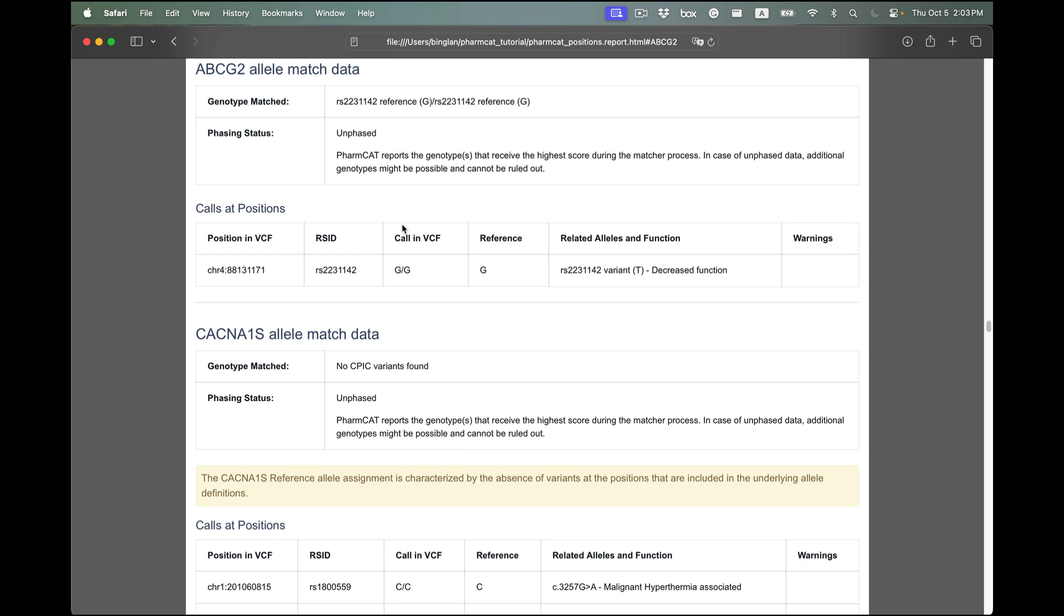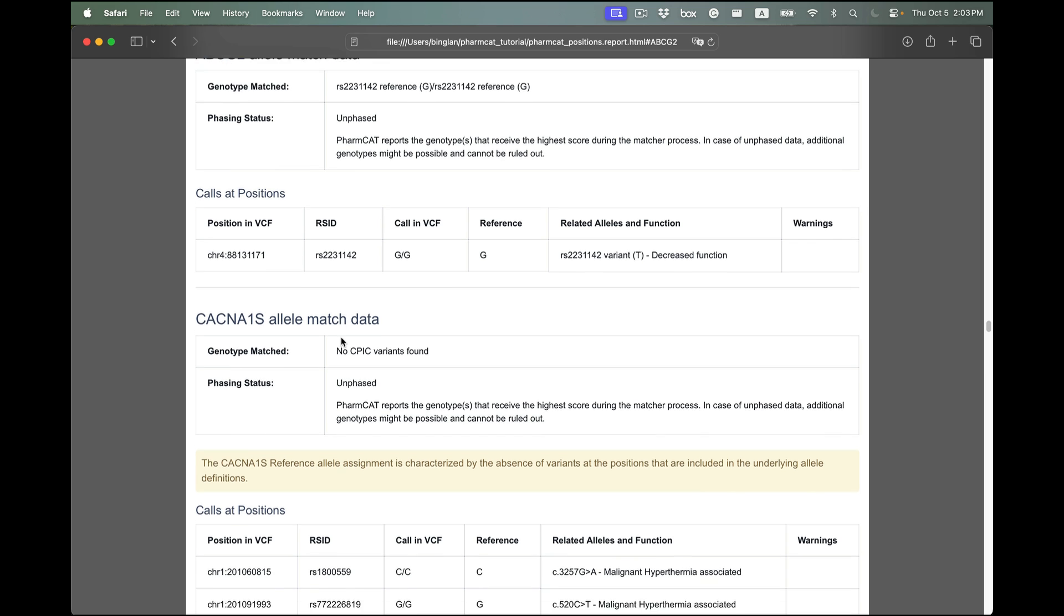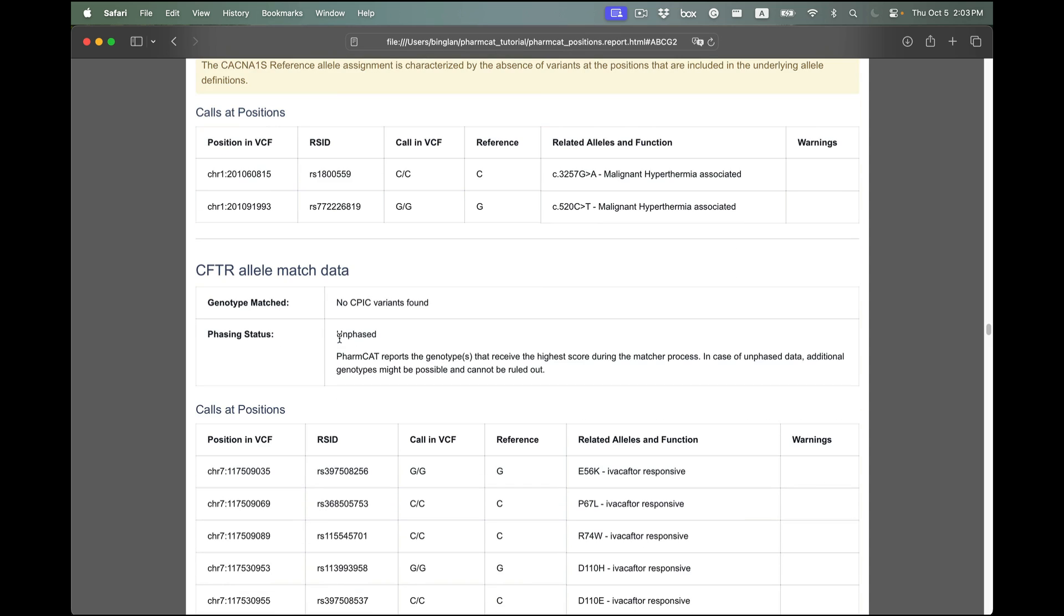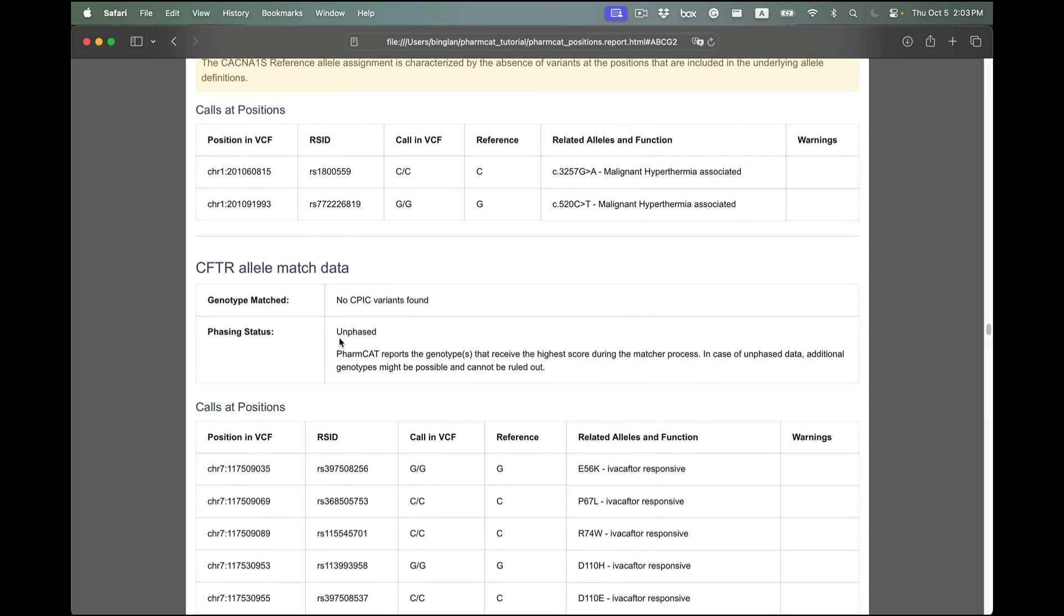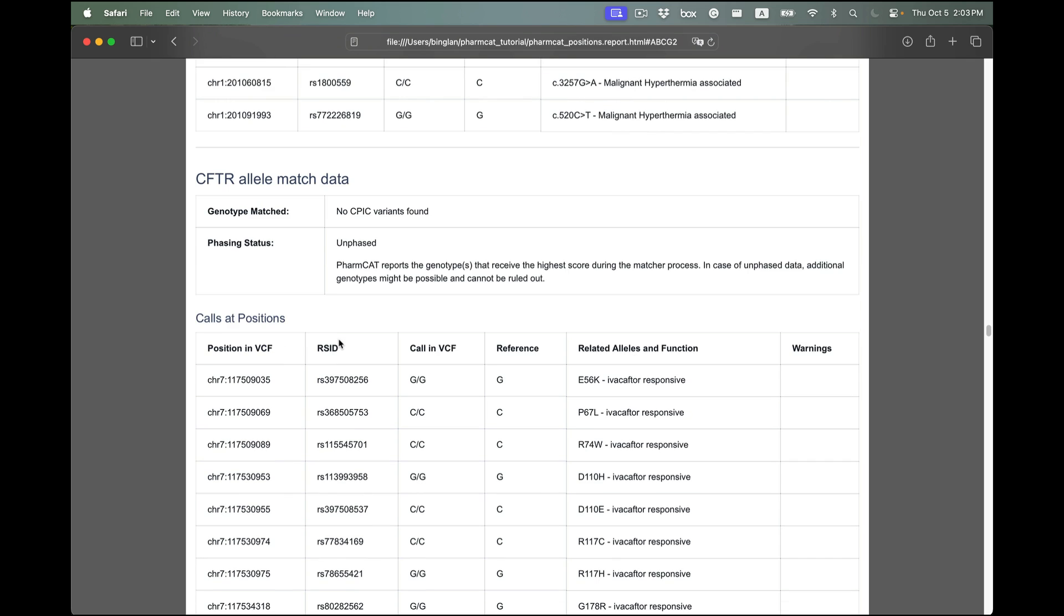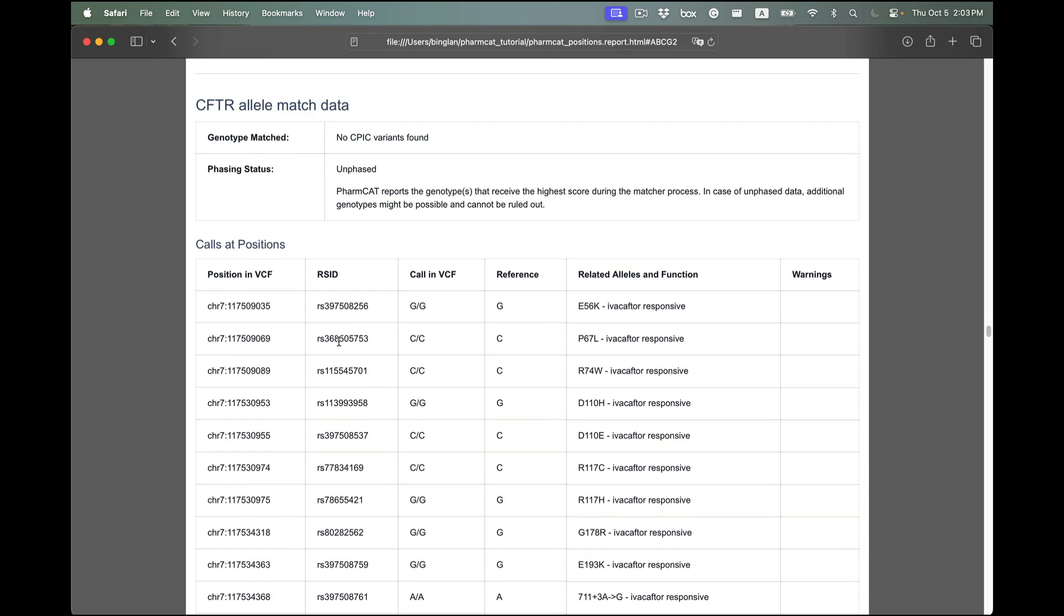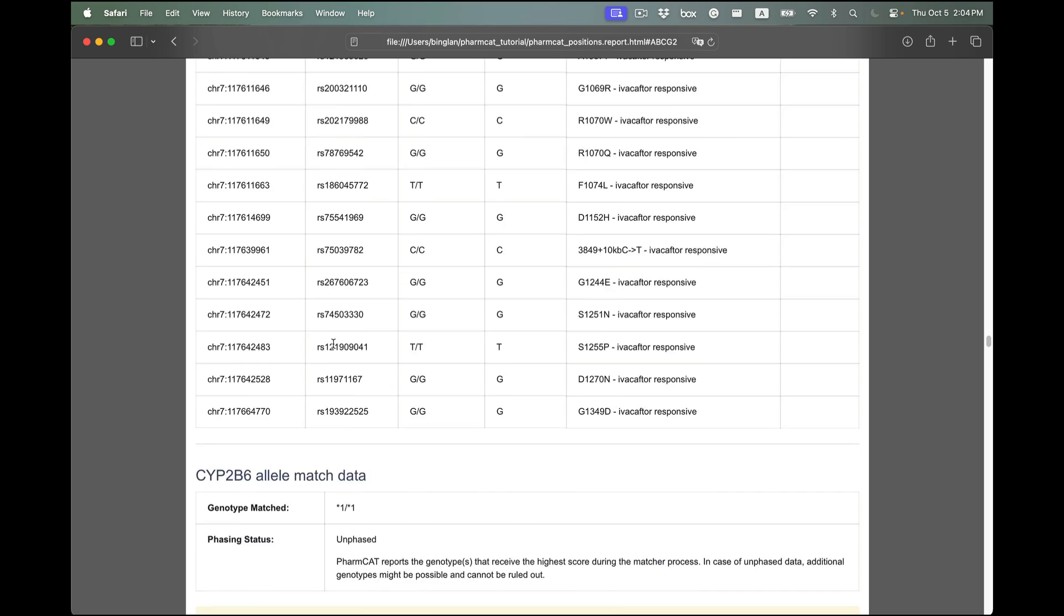This is an example of the ABCG2 gene, but you can also find many more about other genes in this section. This is the third section you see at the top of the HTML file.